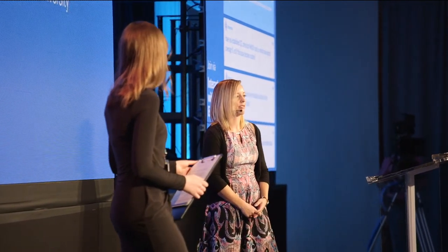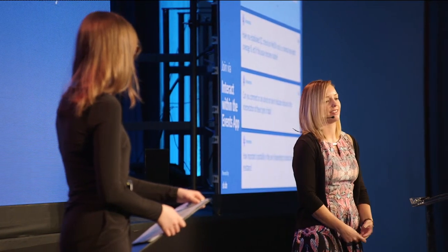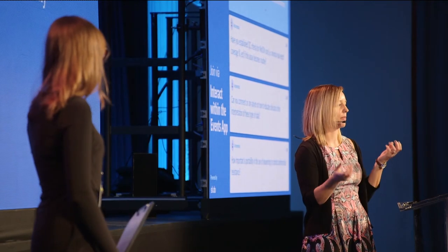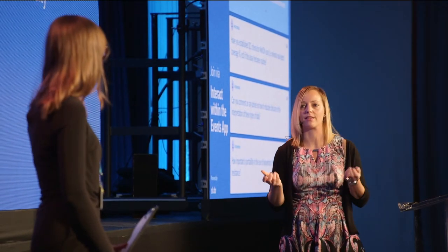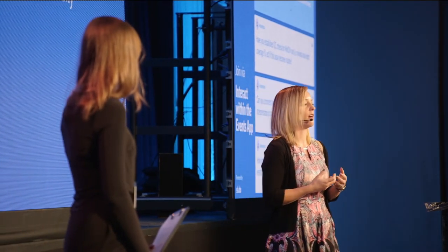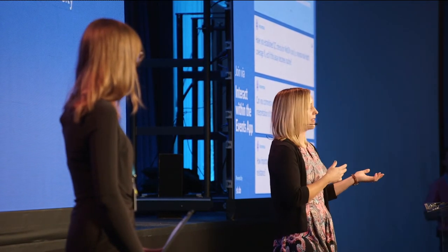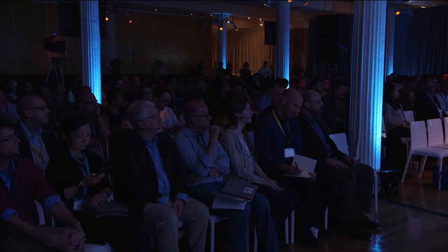I guess we need to create well-curated databases first to start off with. And then second, there needs to be really well-validated studies that go out to show that we could truly replicate and know what the limitations of the methods are. I think sometimes, as we all know, detection of a resistance gene doesn't always mean that it's being expressed, right? And so that's where the difficulty lies. But the nice thing is with nanopore sequencing, we could start out there with just detection of resistance genes. And that's why I think creating the database of the associated phenotype with the resistance genes will be helpful to kind of overcome some of that.